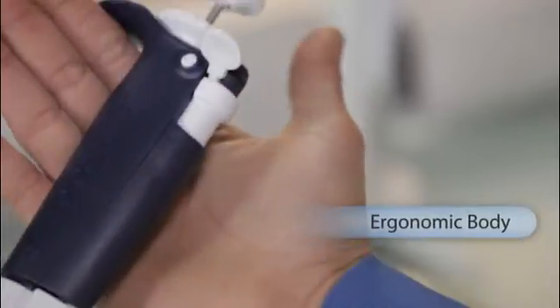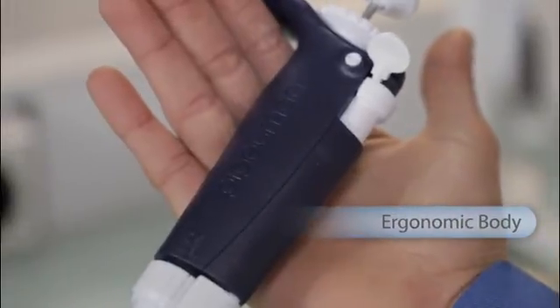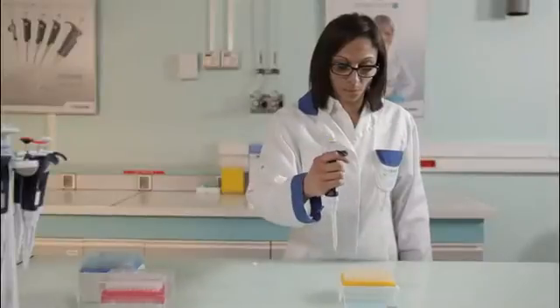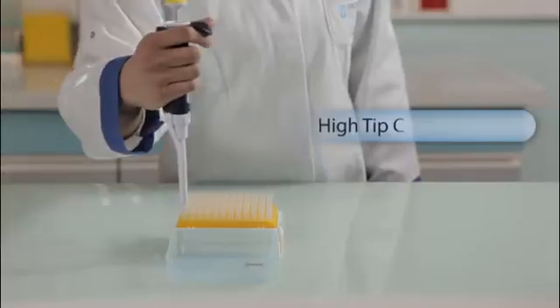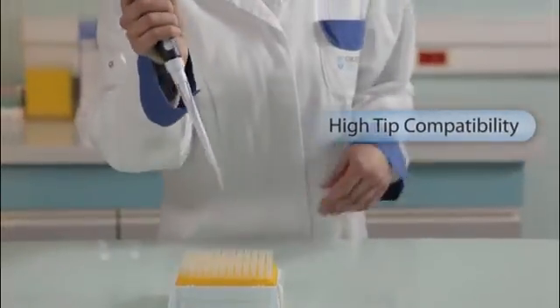The new PipetMan L body shape is made to suit all hand sizes. A very easy fitting of the tip will ensure a perfect seal on the PipetMan L.